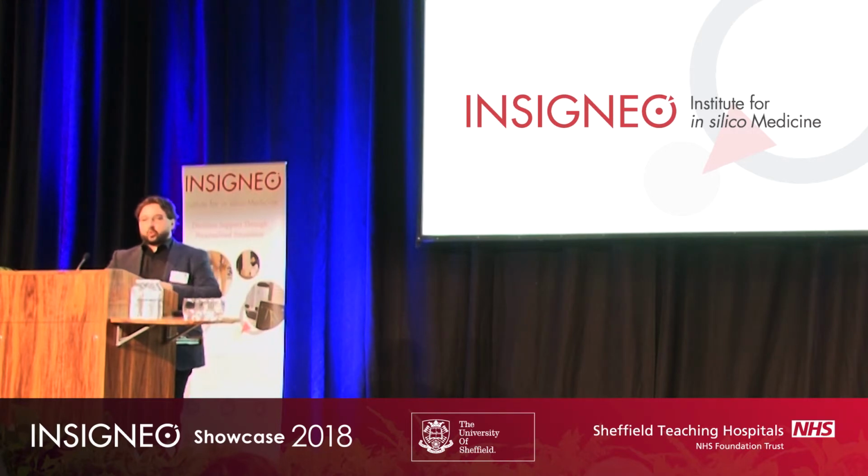So this is the workflow that was defined together with Marco and one of his PhD students some years ago, where for trabecular bone, we can take the micro-CT image and convert it into a 3D image, after proper segmentation, into a micro-finite element model. We apply some boundary conditions, and then we get out the map of displacements, deformation, and strains from the model. This has been done in the past years.